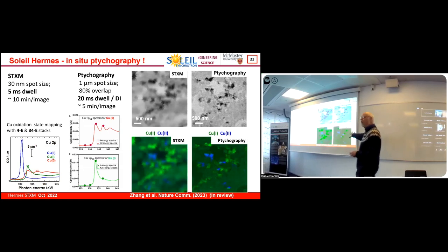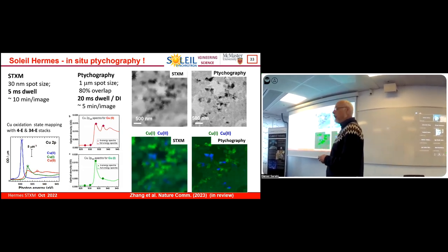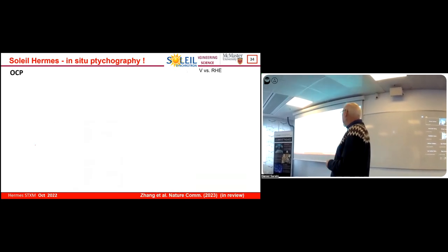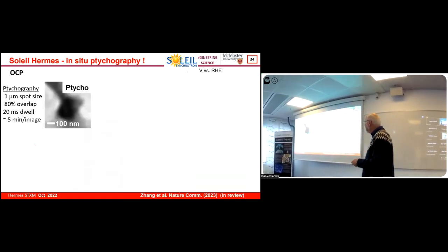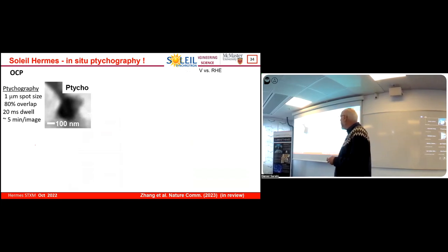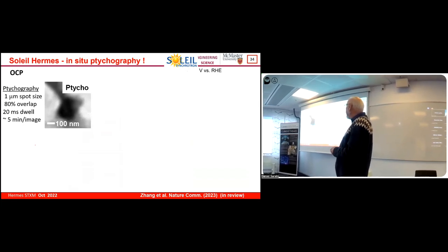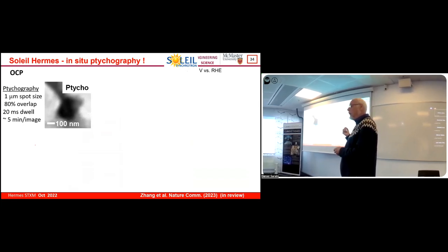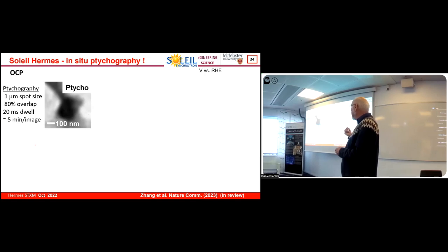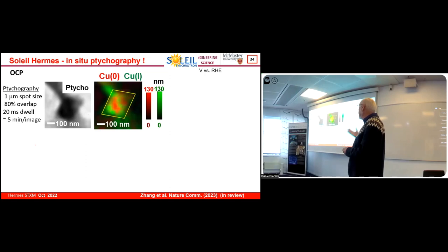Again, it's not record ptychography spatial resolution in soft X-ray by any means, but it's making improvements. And the important thing is we're doing it on wet samples. So again, this is one where we're really starting to make contact with the scientific problems in the field. This is now an individual one of these nanocubes, okay? And measured by ptychography under electrochemical conditions, do the analysis.